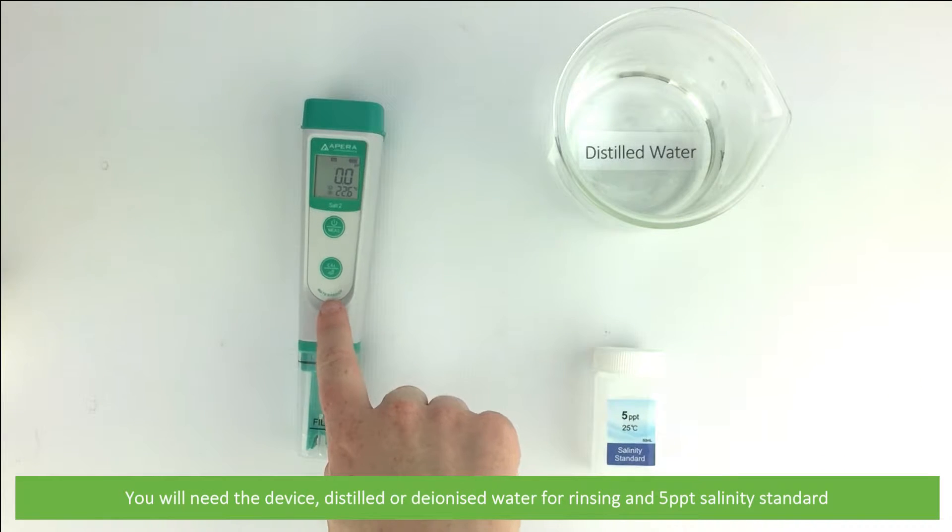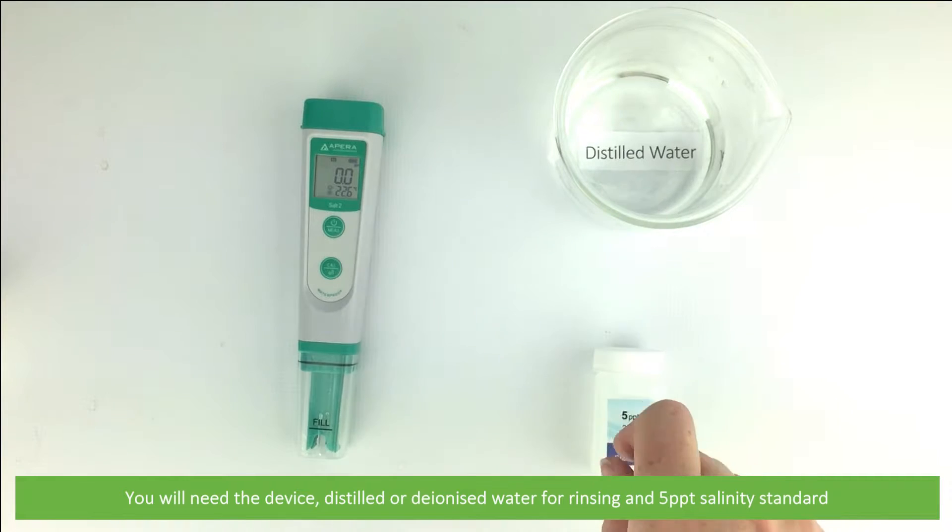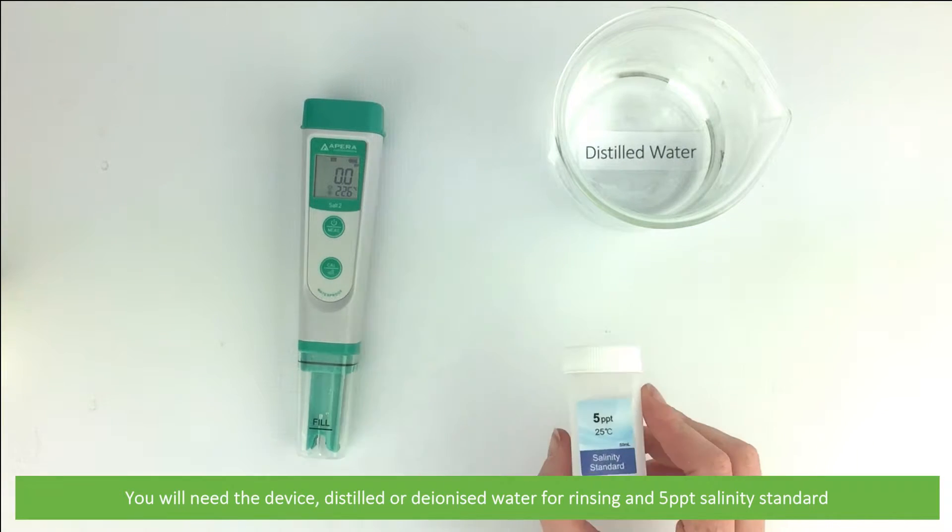To do so you will need the device, distilled or deionized water for rinsing, and the five parts per thousand salinity standard.